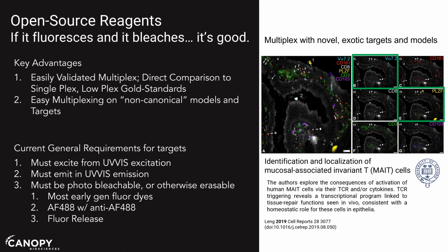But what they were able to do with this is, first and foremost, provide actual in situ data. So these are actually clinical samples. These clinical samples and the ability to show that these MAIT cells were actually close to a mucosal layer backed up a lot of other lines of evidence that were showing that these cells actually had some sort of tissue repair function. So basically they did tons and tons of work that showed that this should be the case, but they used ChipCytometry, spatial biology in general.